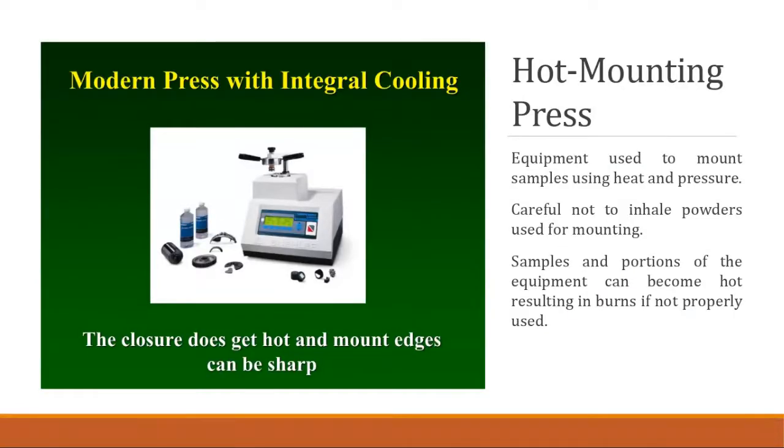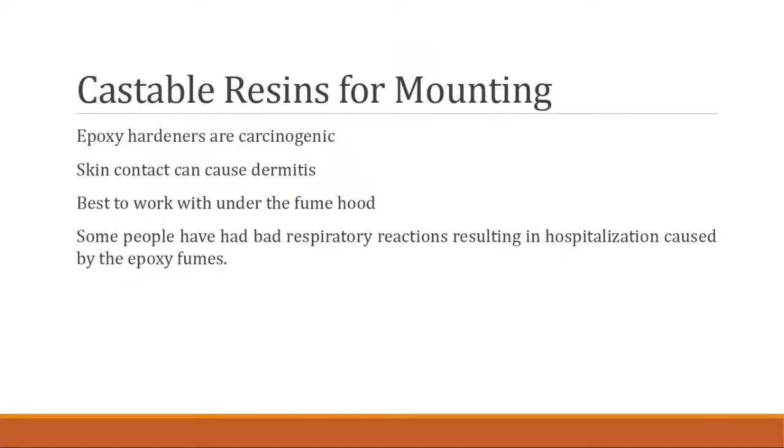Mounting equipment. This is one of the methods you'll be using to mount samples. This is essentially using pressure and heat, and within about 10-15 minutes you have a sample that's ready for metallographic preparation using the polishing tables.